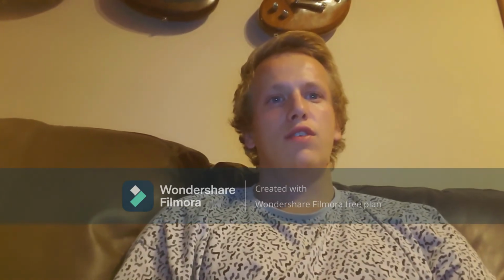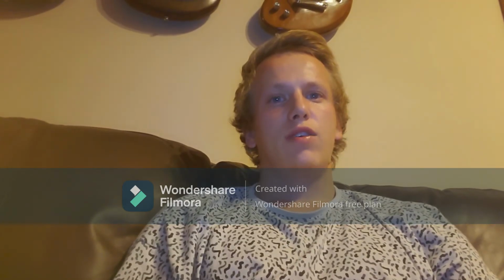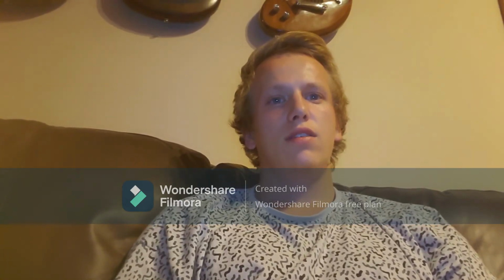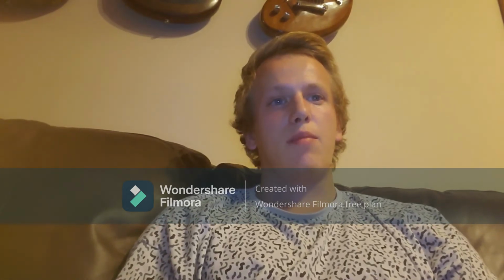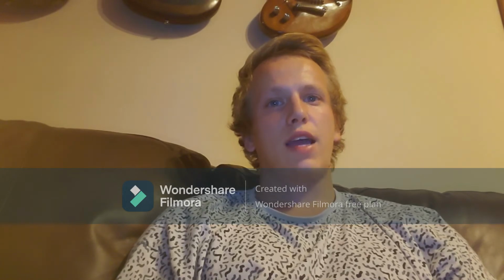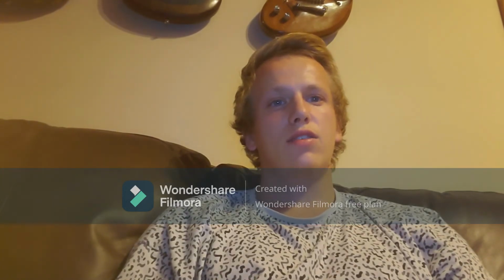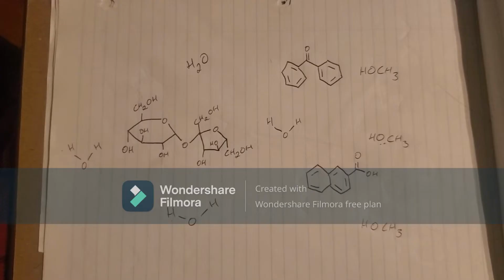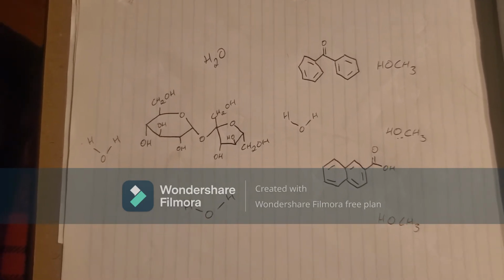Then I would dissolve the 2-naphthoic acid in cold methanol and filter out the pure benzophenone solid to isolate the benzophenone. Then evaporate the methanol from the 2-naphthoic acid solution to leave behind the pure 2-naphthoic acid crystals. And then there you go. So basically my recrystallization will go like this.